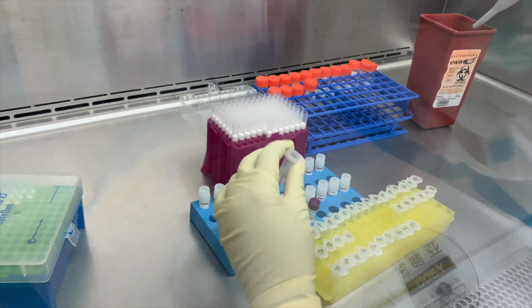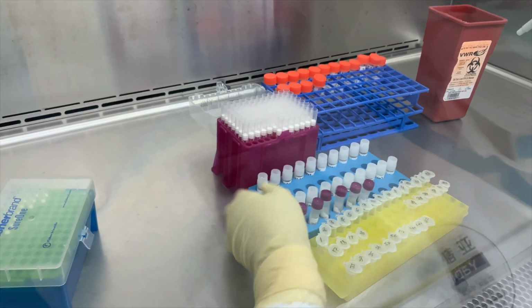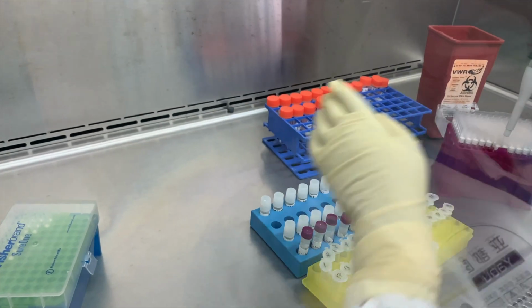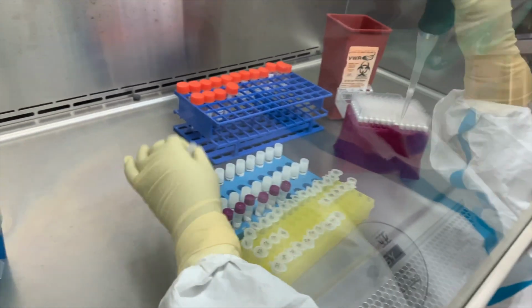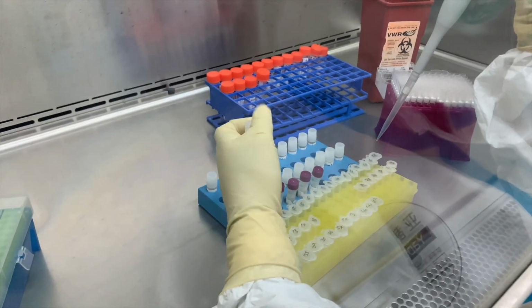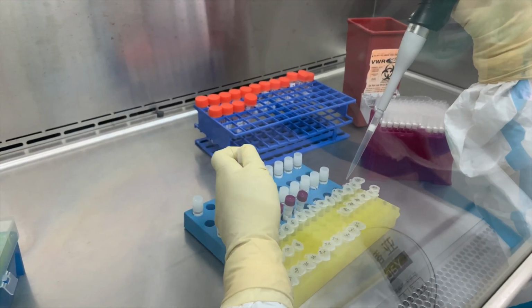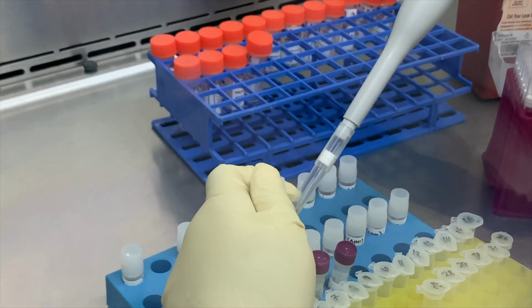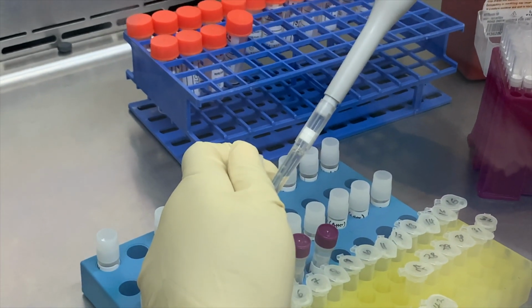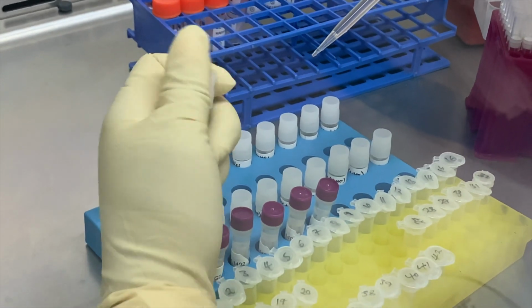Usually when working in science, you always open the tubes with your left hand, because the other hand is holding your pipette. Once you open it, you use your pipette to suction the fluid from inside to a certain volume, depending on the protocol we're using.